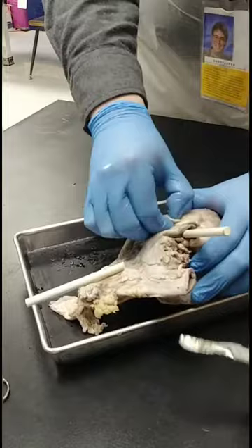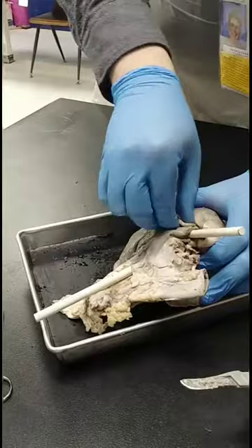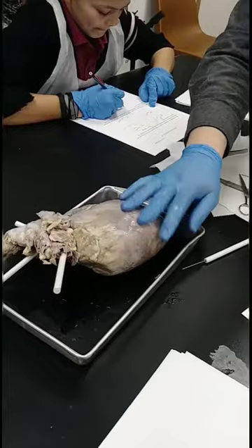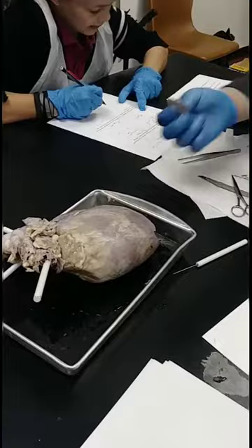So you can take your scalpel and start cutting into that groove, the interventricular groove. That's part of the inner pericardium. We don't have the complete pericardial sac. That'd be a layer over this thing filled with fluid to protect the heart. But we have part of it. That's that membrane on top of that.